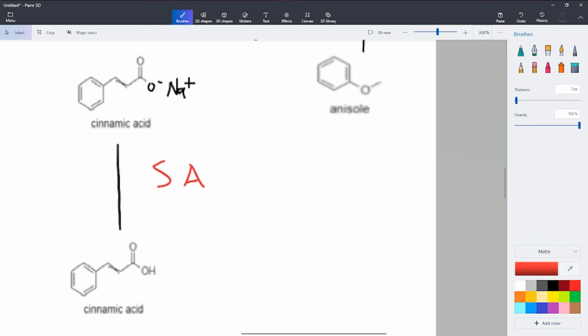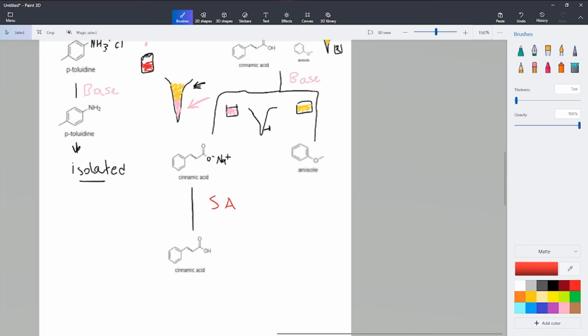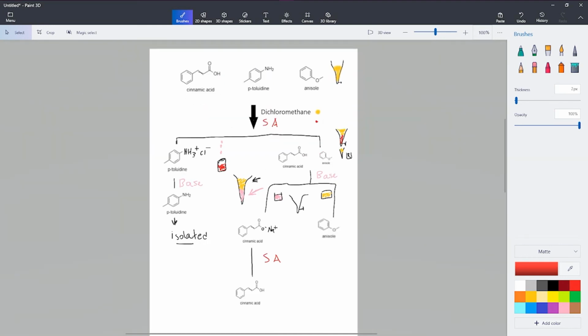And over here, all we have to do is just purify this by distillation. We can just distill this and we'll get our neutral. We can also use crystallization, or we can use a drying agent for this. And this is basically all the steps to acid base extraction.